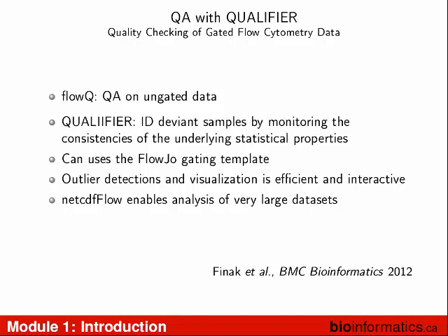Everything that we do is open. Everything we do is based on open standards. One of the hats that I wear is that I chair ISAC's Data Standards Task Force. So we wrote the FCS 3.1 standard, and we describe it, and we tell you what has to go in each spot and what each spot means. We do that because now all the instrument developers use that same description when they write the FCS file. We just wrote a standard for gating, but right now nobody's using it because we just developed it.